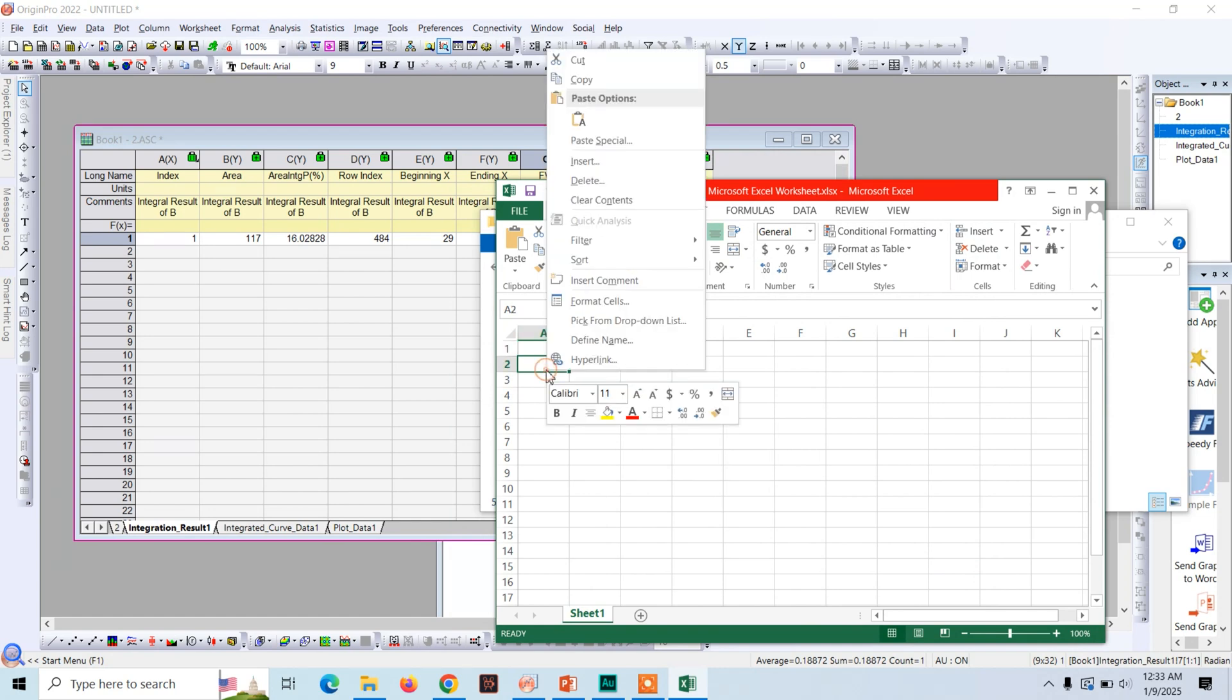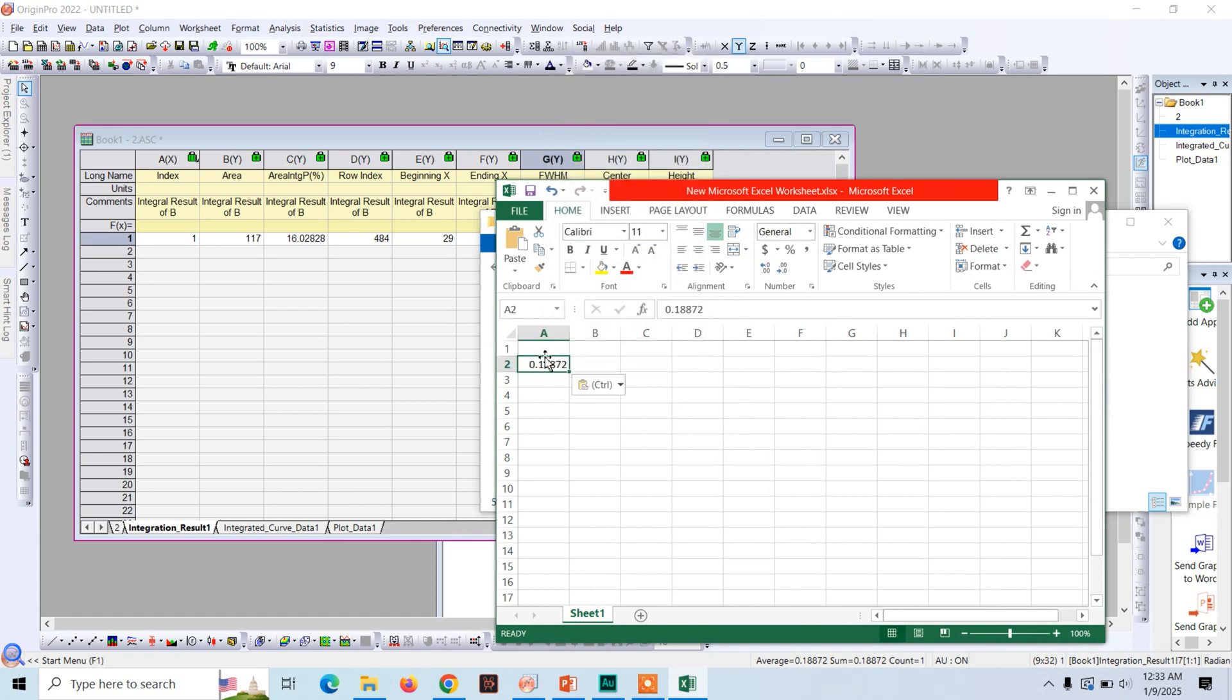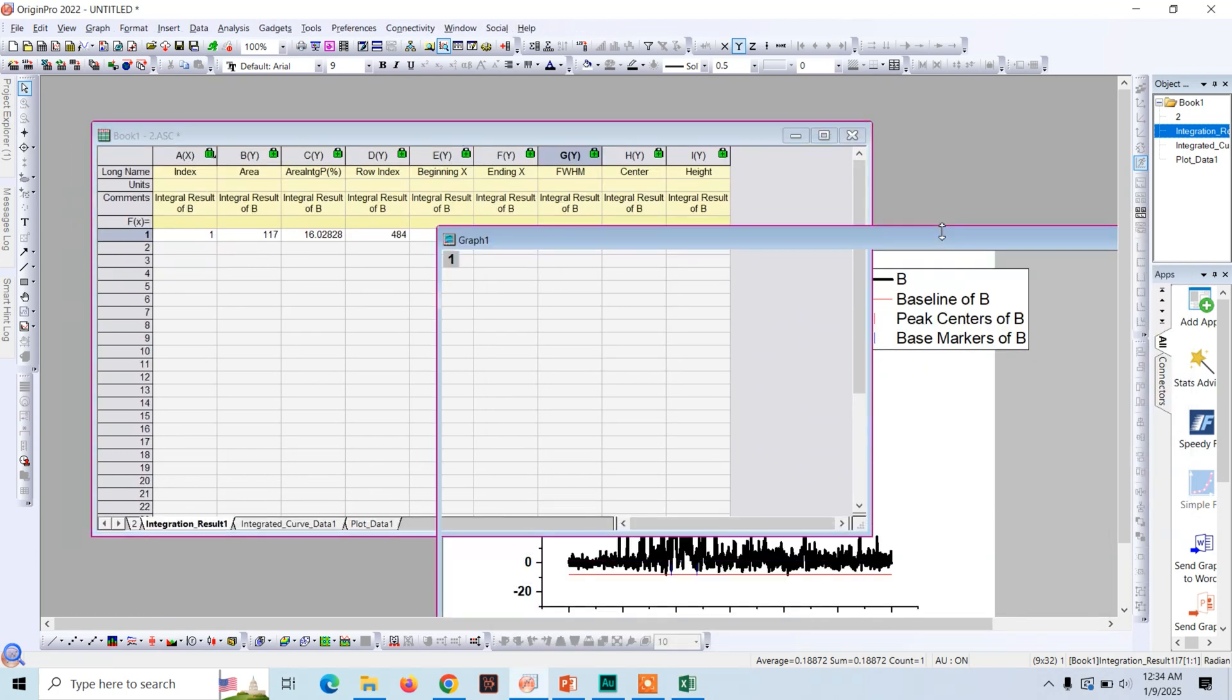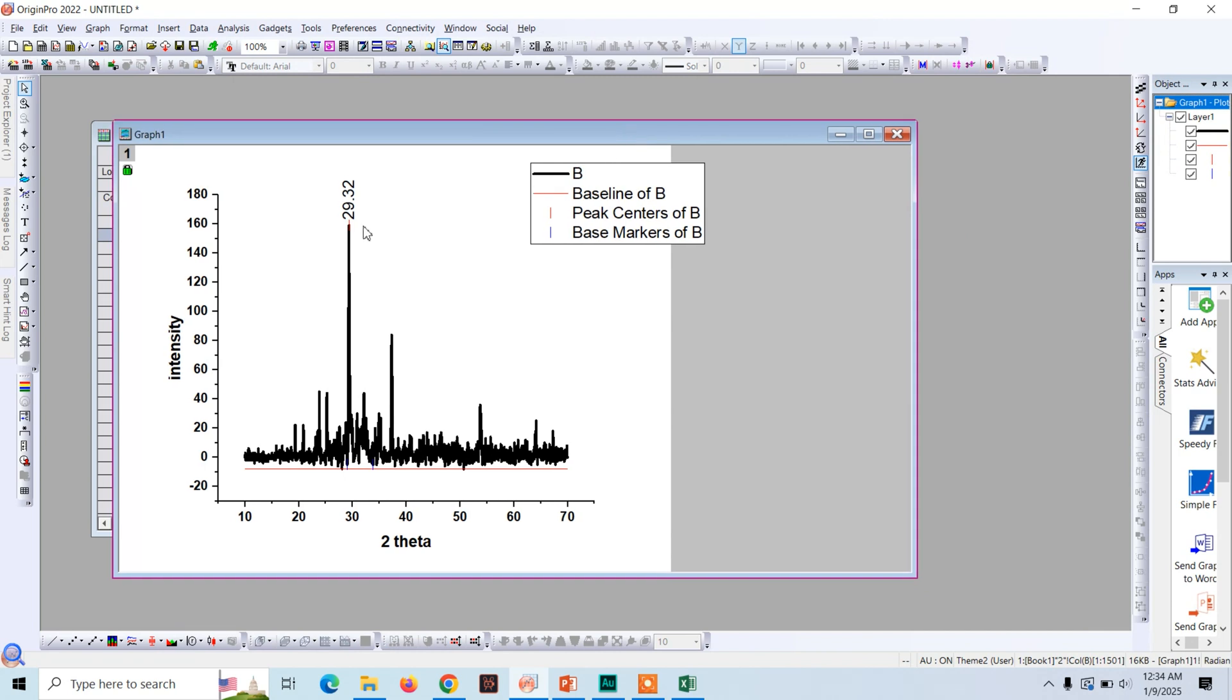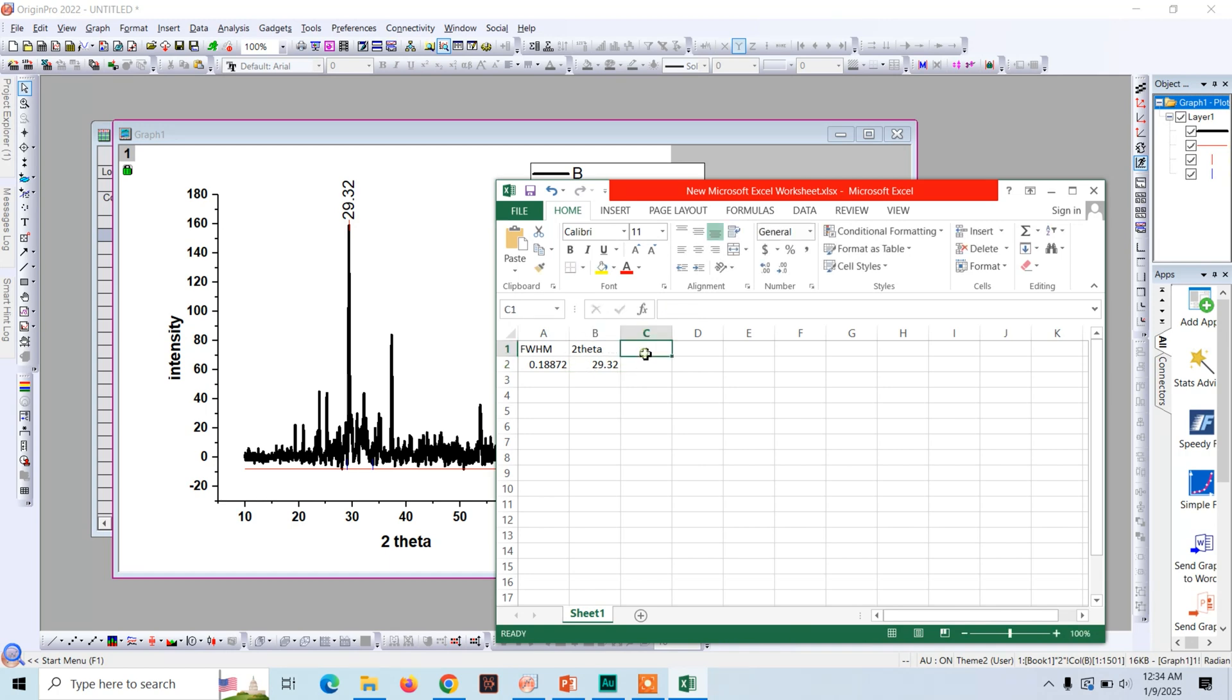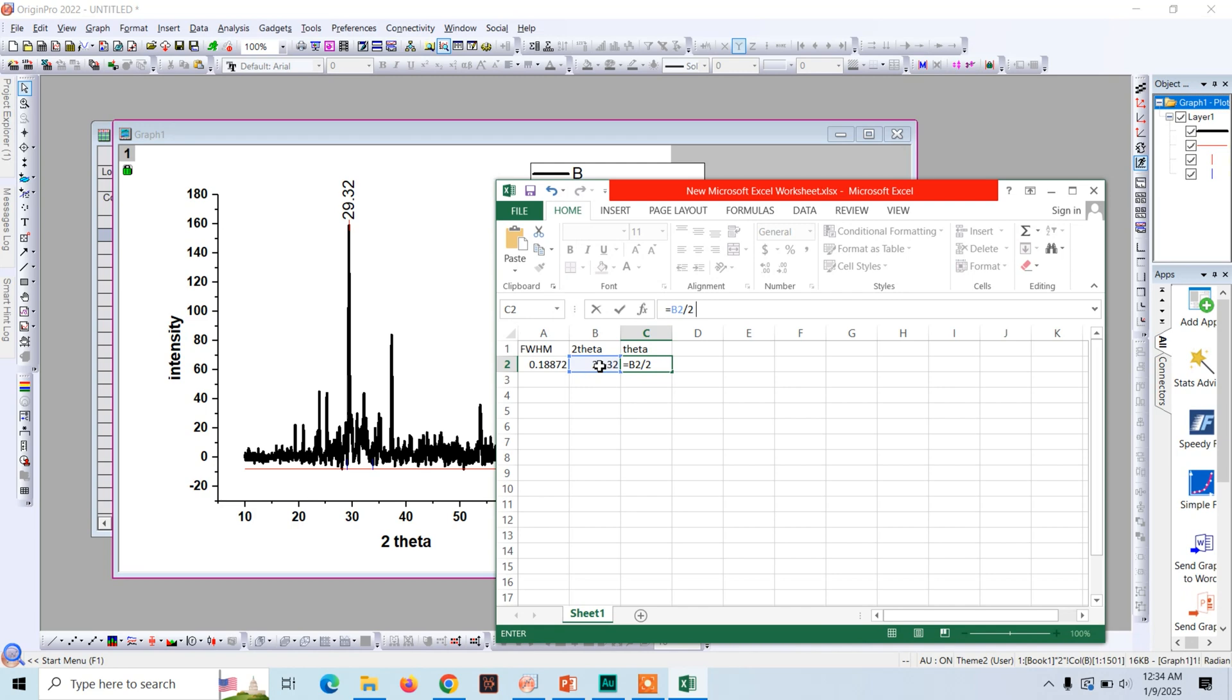This is the full width FWHM. Now we need to convert this into radians. And theta. The value here, 29.32, represents the two theta. Two theta is 29.32. First we are going to convert this two theta into theta.